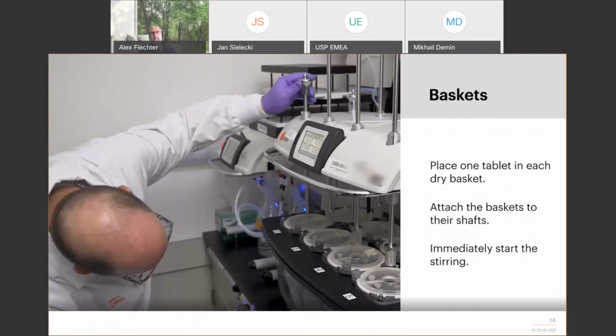When you do the basket test with PVT, it is essential to dry the baskets and to put the tablet into a dry basket. Why? Not only the prednisone formulation is sensitive to degassed medium or non-degassed medium, it is also sensitive to picking up moisture.